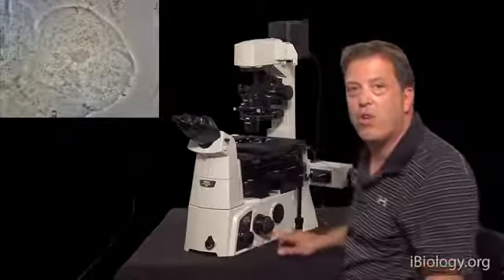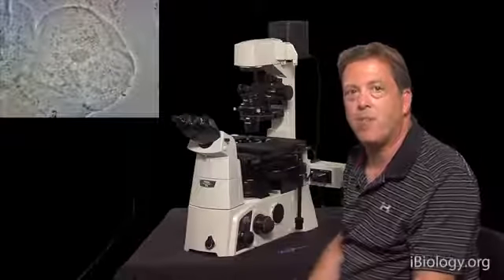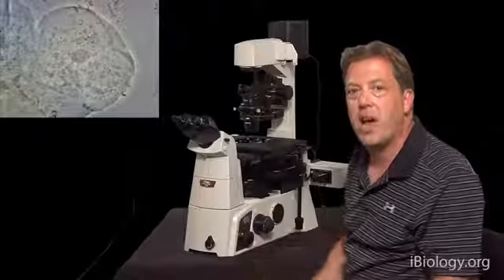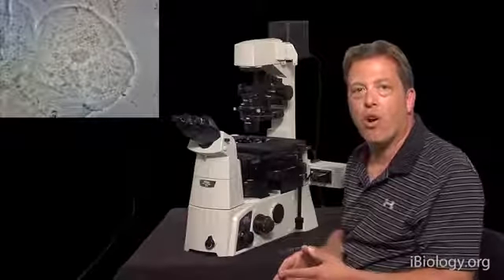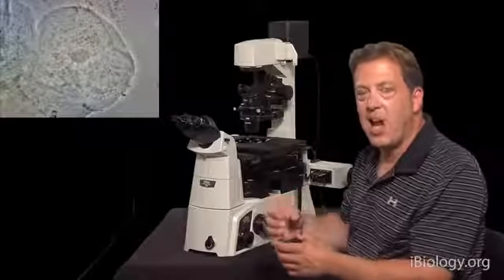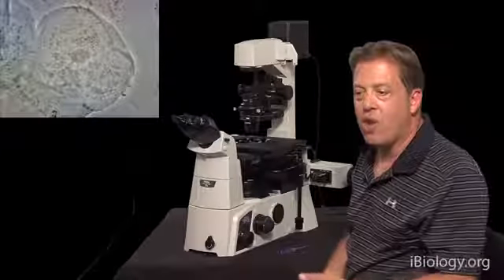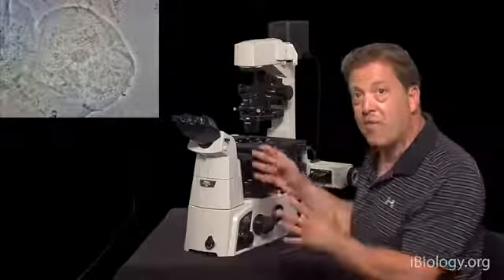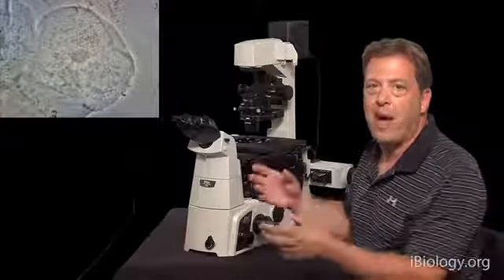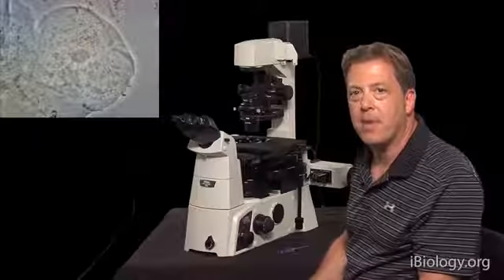So again, that's really all there is to phase contrast. If it's not working, generally it's a simple alignment issue. The other thing that would be obvious at the back aperture, if the system's not working, is that your annulus has to be specifically sized to match that objective lens and condensing system. So if it's not working and you have the components, they're either out of alignment or you have a mismatch between the size of the phase ring and the phase annulus. Okay? Thank you.